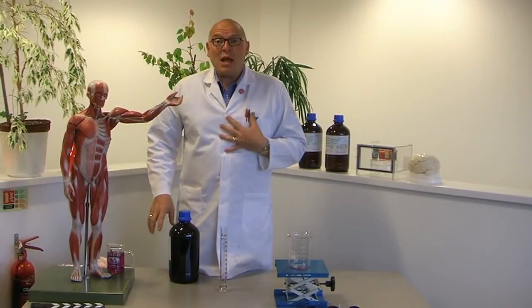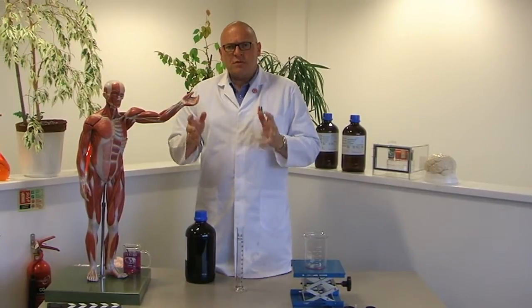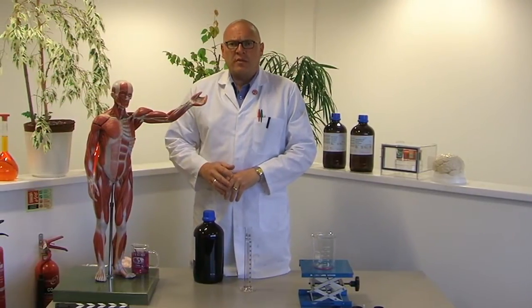Hello again. It's me, the lab warehouse man. You're just in time to see me demonstrate how to measure out a hazardous liquid in the laboratory.